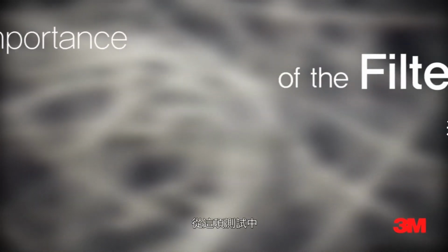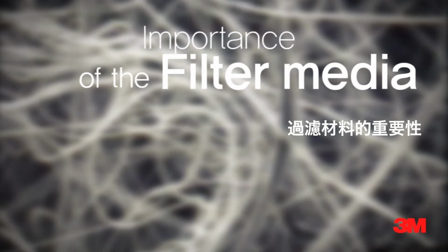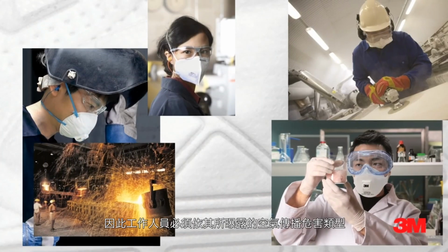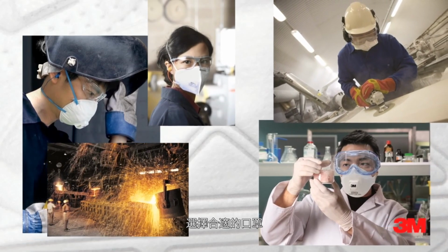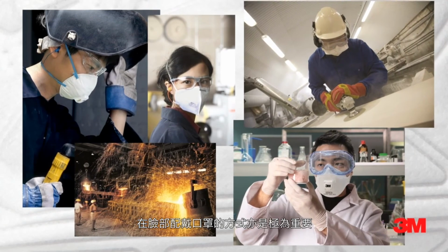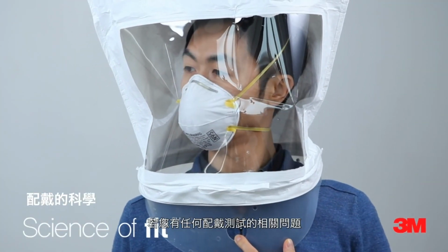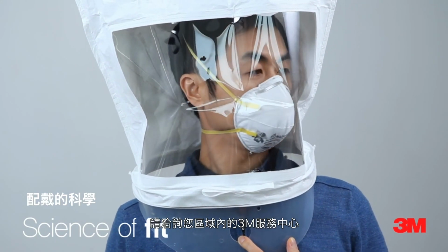From this test, we can see the importance of the filter media on the respirator, so workers have to select the proper respirator by the airborne hazard types. The fitting of the respirator on the face is also very essential. If you have any questions about the fit test, please contact 3M in your region.